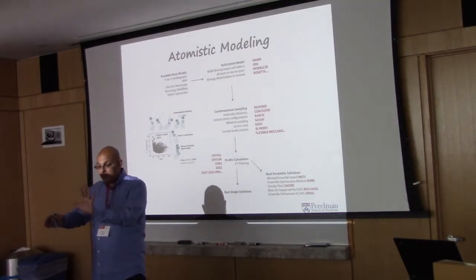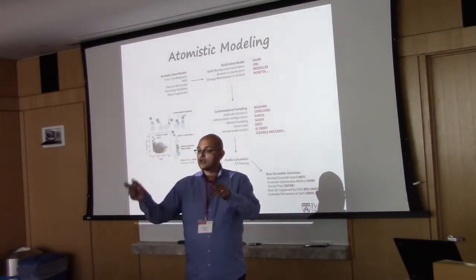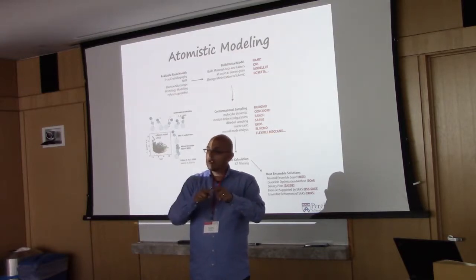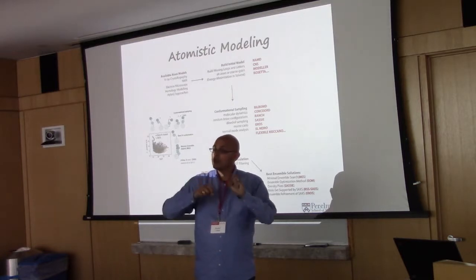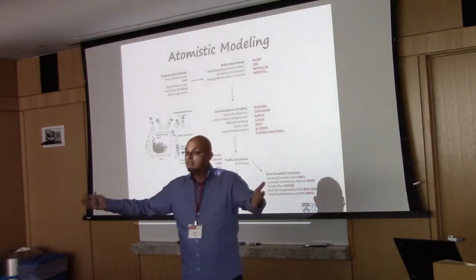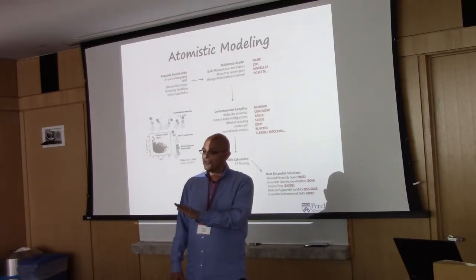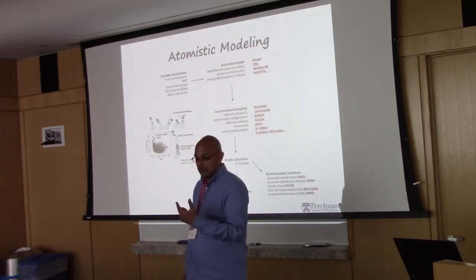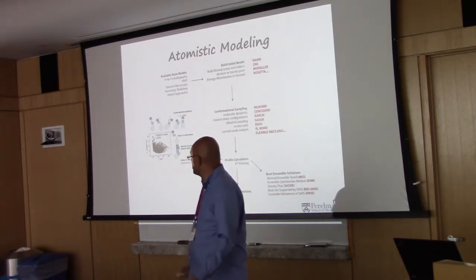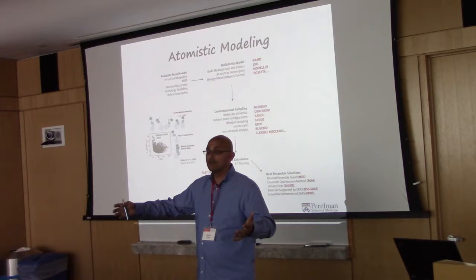Now you can compare those profiles to your experimental data, and use a metric, chi-square or whatever it may be, with many different ones, and see which profile or combination of profiles best agrees with your experimental data. So you're testing a hypothesis here in a very expansive way. This is not shape determination. This is testing hypotheses. And so the solutions you arrive at are not exclusive of other solutions that may also fit the data. That's why we generate many candidate structures, with the hope that we can get a sense of the breadth of the solutions that make sense.